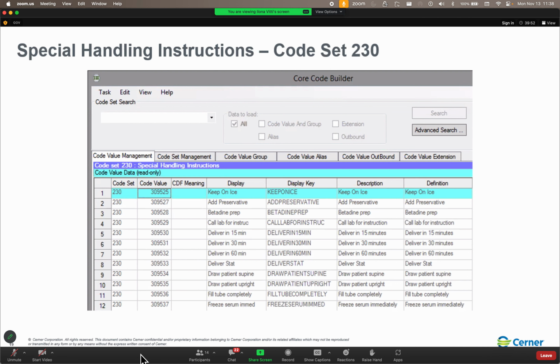And so we set a time frame. So it might be 60 minutes, it might be 120 minutes, it might be more than that. But then when it looks ahead, it is going to look at the group flag, not only of the order that is getting its accession number right away, but also the orders that are scheduled for that patient.